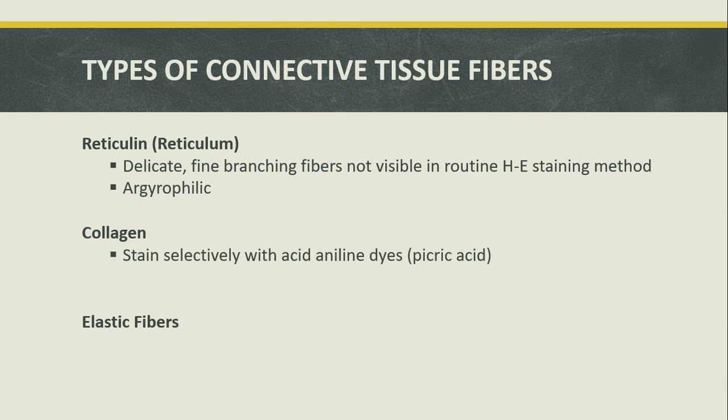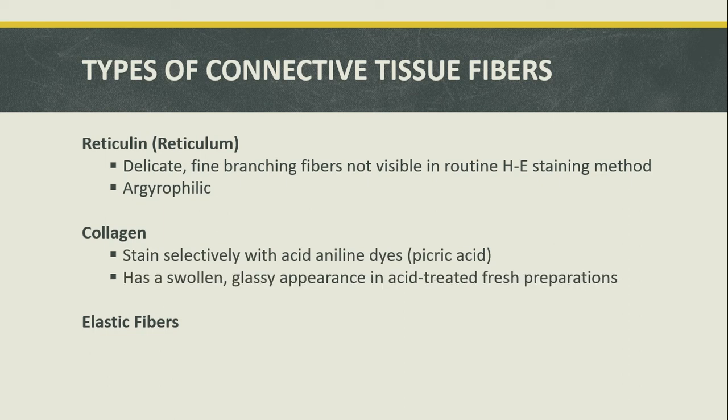Collagen forms a much coarser extracellular framework than reticulin. It stains selectively with acid aniline dyes, the most common of which is picric acid. In acid-treated fresh preparation, collagen has a swollen, glassy appearance.